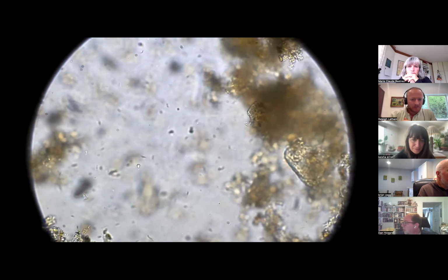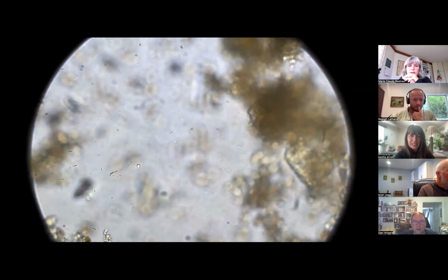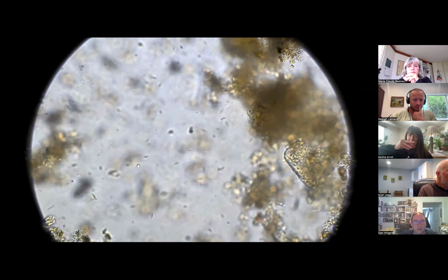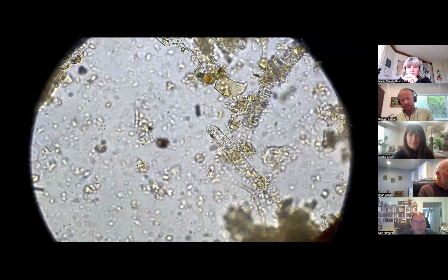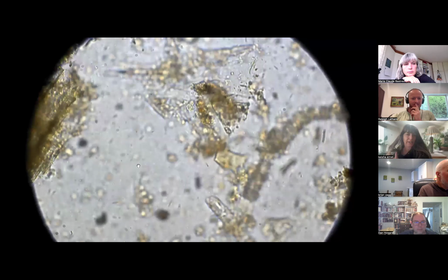So these are spirochetes? Spirilla? Spirilla. Okay. Spirochetes can move all over the place. Spirilla are like a corkscrew through space. They move at angles. Is that the one that Elaine was like, when you see it, run away? Spirochete and spirilla both can be scary.